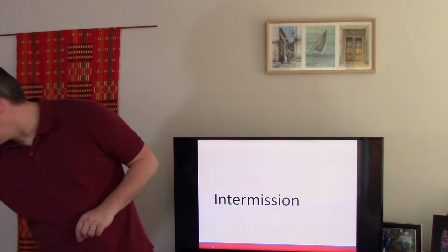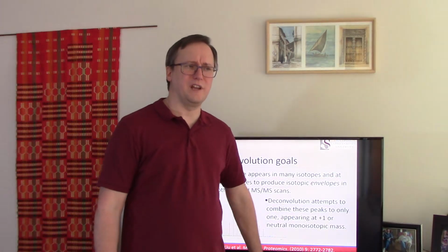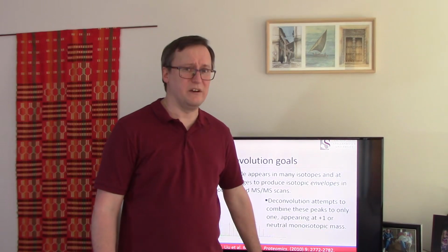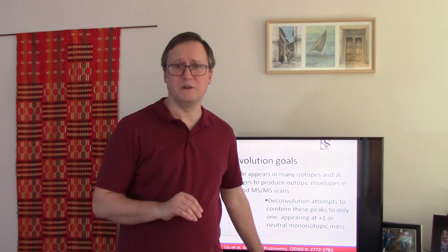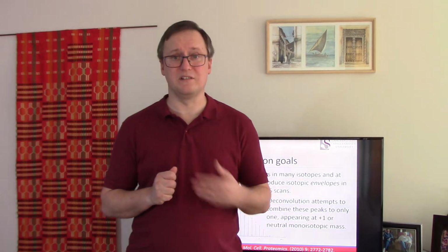And welcome back. In this part, we're going to move from thinking about analytical chemistry to the algorithms we use for making sense of top-down tandem mass spectra. We start with something that's not, strictly speaking, identification, but is quite necessary to making sense of a lot of the spectra that we deal with. I want to talk about two ways that a particular fragment may appear in multiple copies throughout the spectrum.